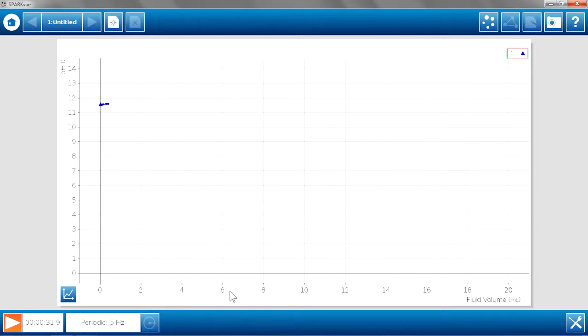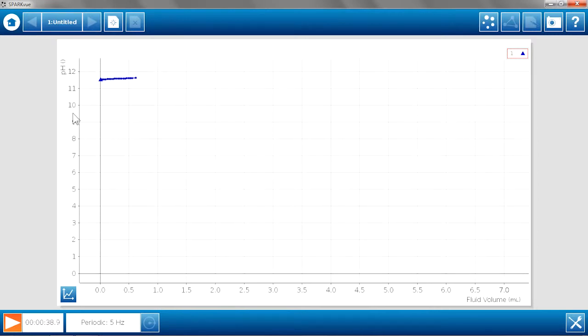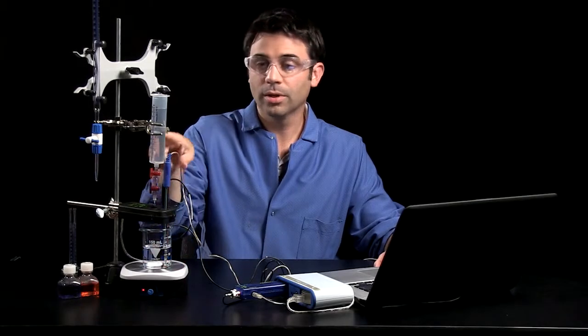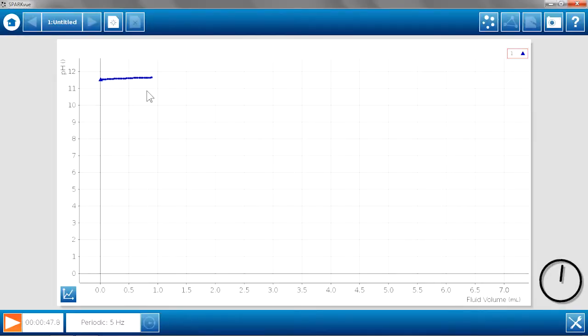And I'm going to rescale my graph a little bit. Here's my initial pH very high because I'm titrating sodium hydroxide with hydrochloric acid. And we'll let this go and see how the titration curve looks.